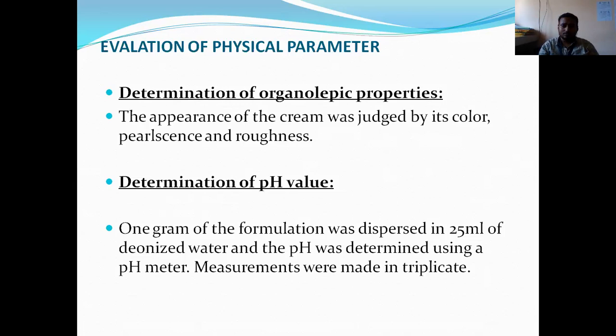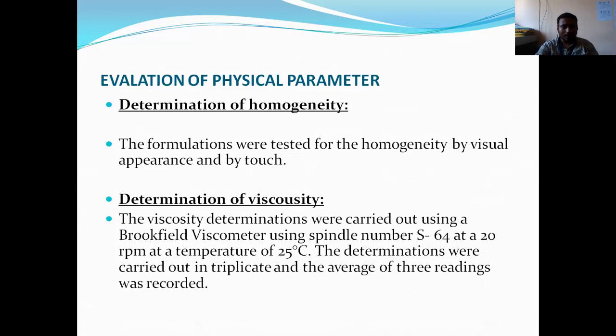Another evaluation of physical parameters is the determination of homogeneity. The formulation was assessed for homogeneity by visual inspection and by touch.